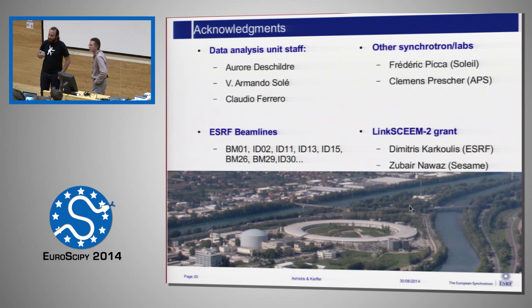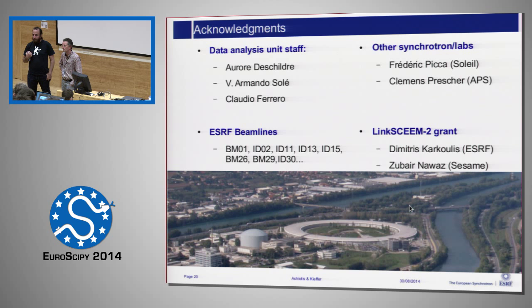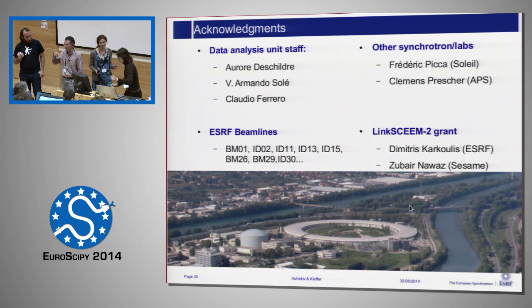Since your quadrature scheme is just a sparse matrix multiplication, why not pre-compute the sparse matrix and just call a sparse matrix library, like the one from SciPy? It gives really good performance. The problem is that some pixels may go mad from one image to the next, and the detector may mark them as dead. So we need, in addition, an extra step to check that the pixel is still valid when it's read. So we need an extra check within the sparse matrix multiplication. So this is why we don't use it.